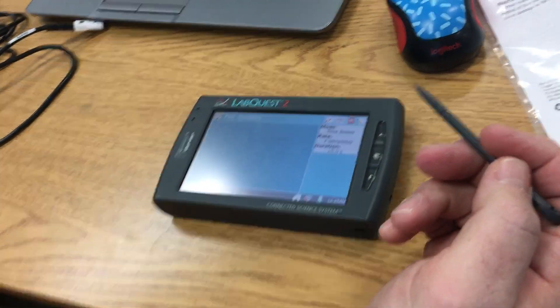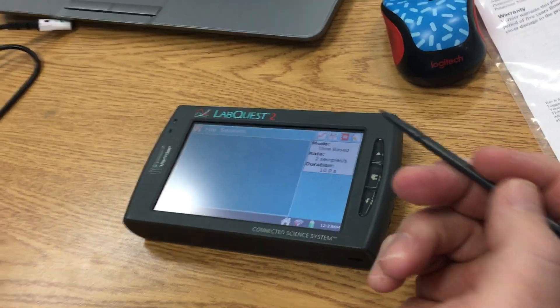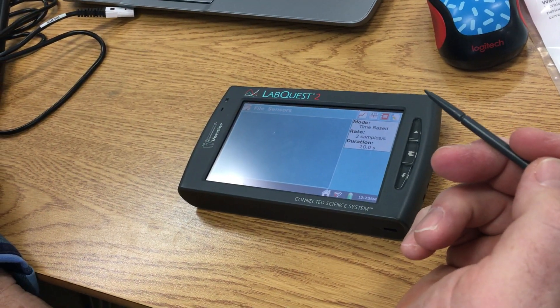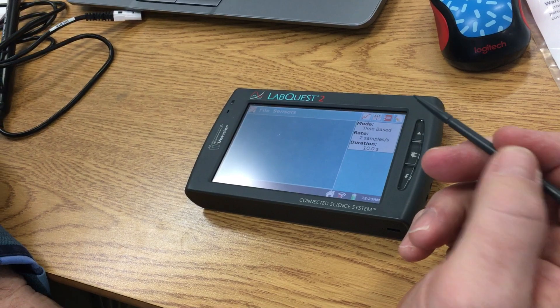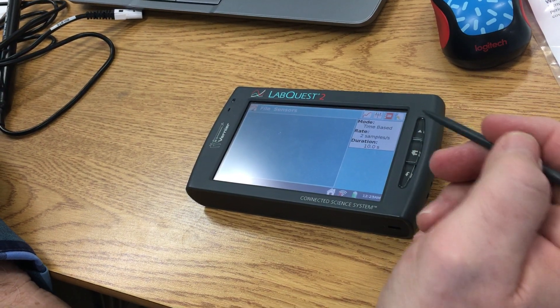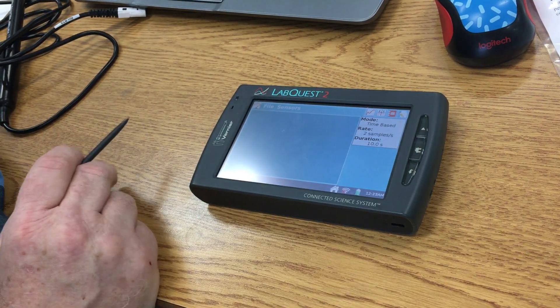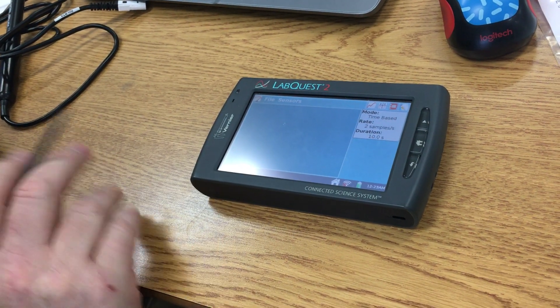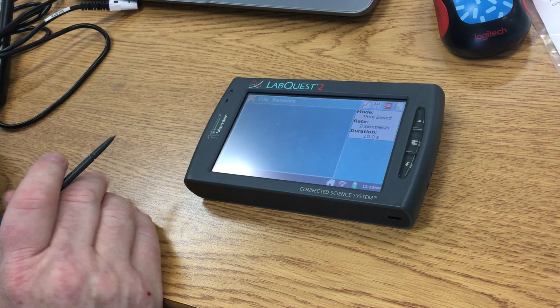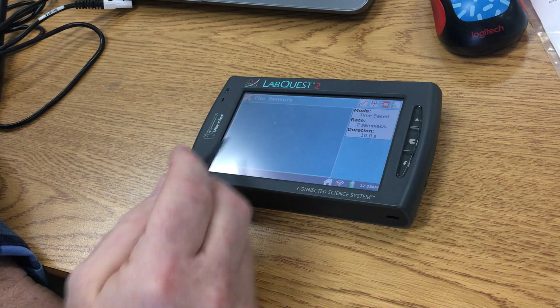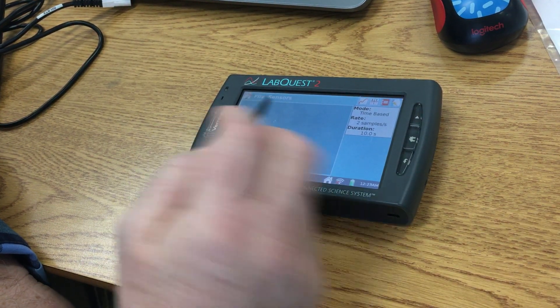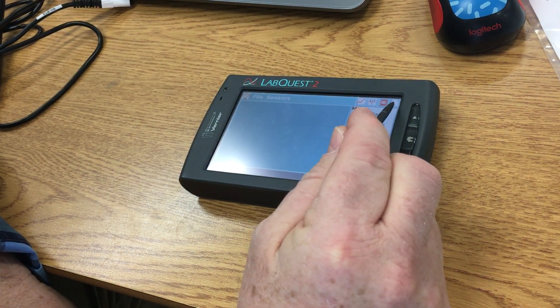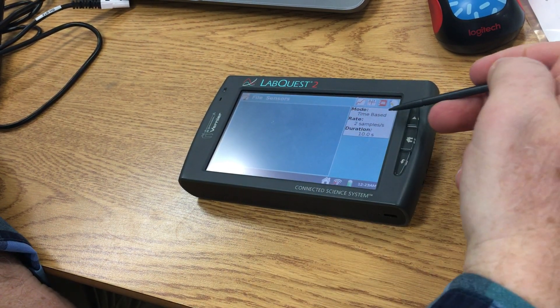Okay, hi. This is what your LabQuest looks like when you get it booted up. Notice it says File, Sensors, and you've got these icons across the top.